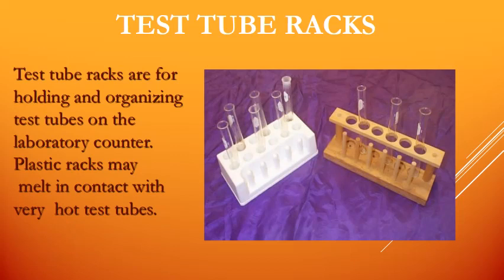Now, if you use a plastic rack, you have to be careful. You cannot put hot test tubes in a plastic rack, otherwise that plastic will melt and automatically the test tube rack gets damaged.